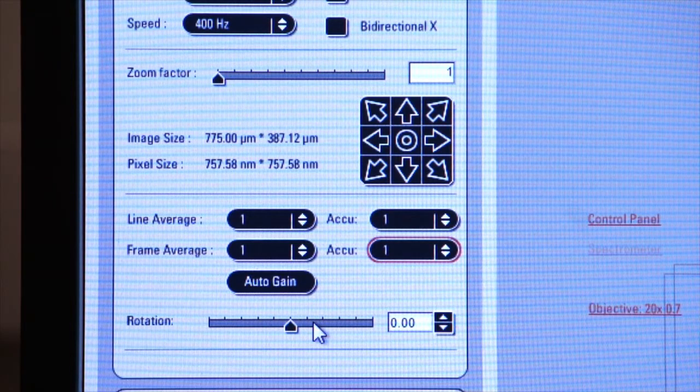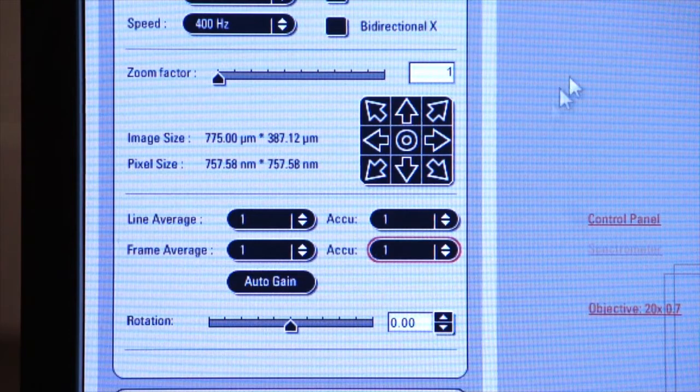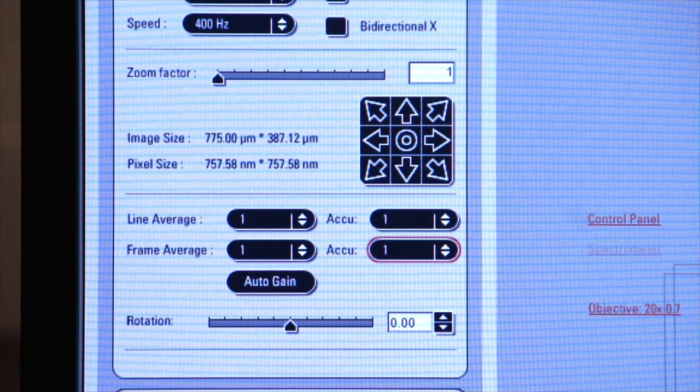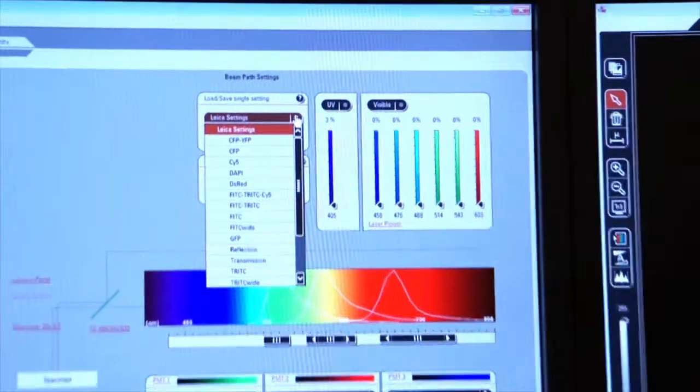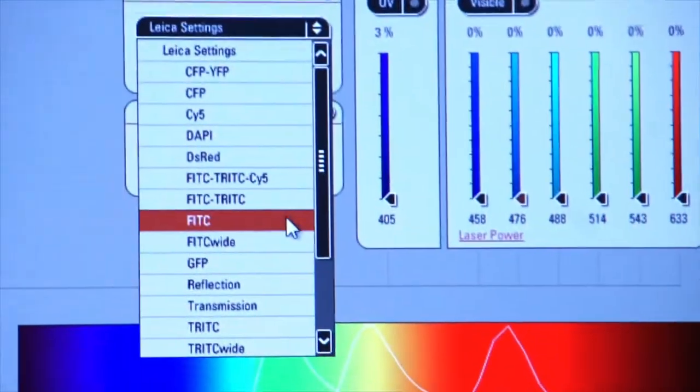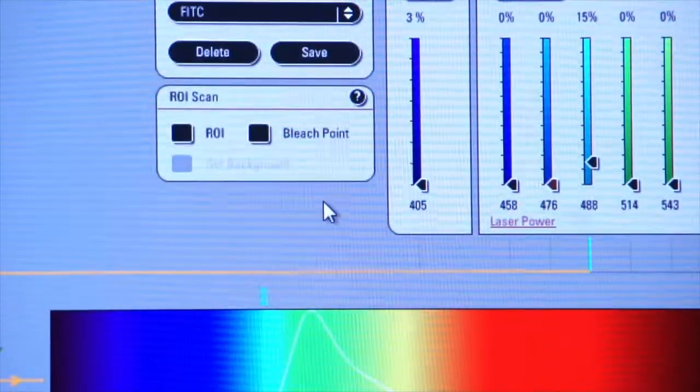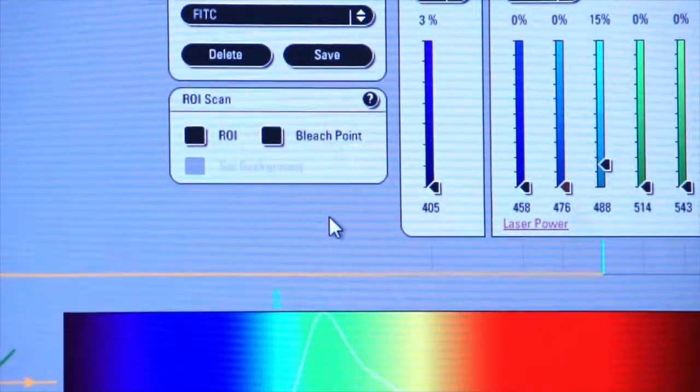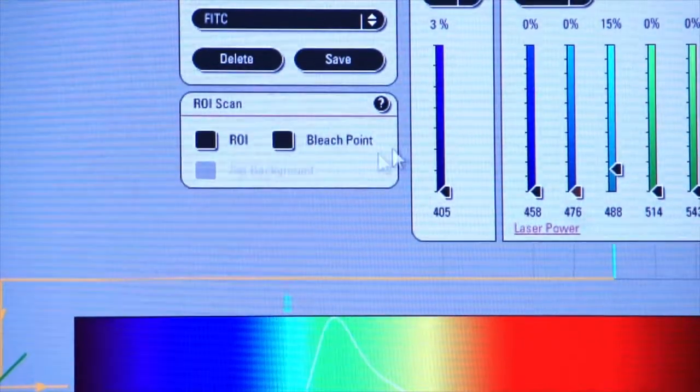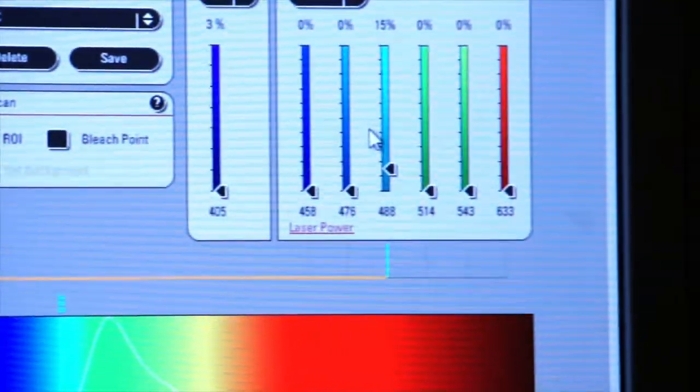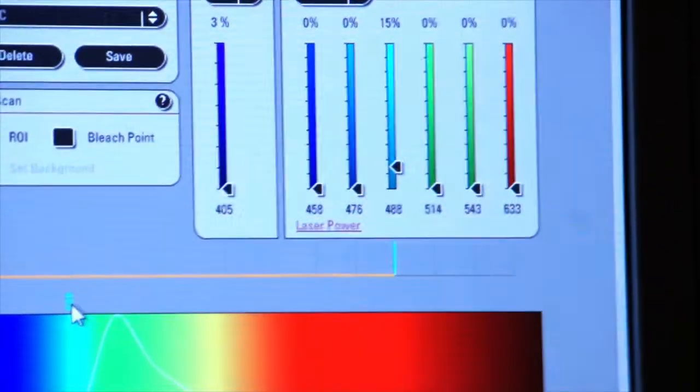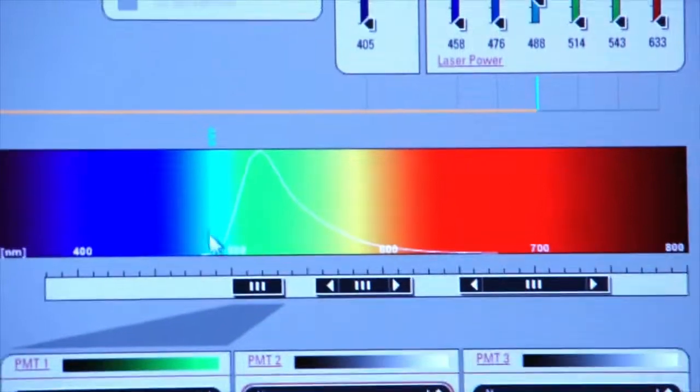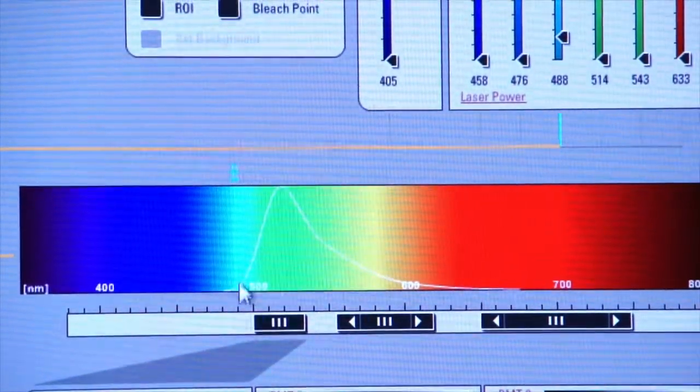So we're going to begin. We'll come over here to Leica settings and we will select FITC to start with. And so if we select FITC, the system will automatically turn on the appropriate laser and you see that the 488 laser line is illuminated here on the spectrum and it also gives us the emission curve.